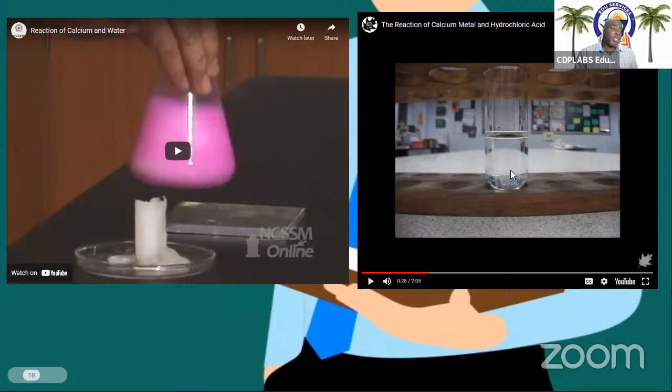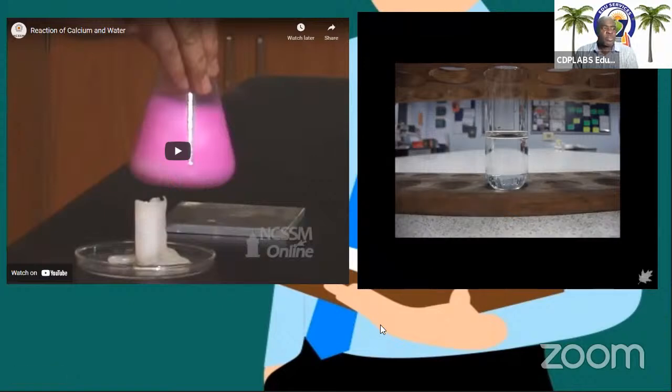Very important. Before going further in the video, what you're seeing right here, the wooden material, is called a test tube rack. So this is a test tube with the hydrochloric acid inside of it, and then we have the test tube rack. And yes, same hydrochloric acid that comes from the stomach. Now the acid, and watch what happens.